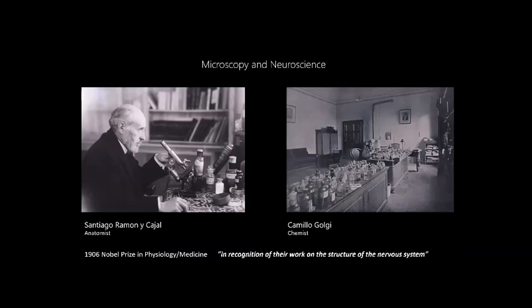Okay, so much like many of you, my lab develops tools for neuroscience, and specifically, we work on developing both microscopes and fluorescent indicators so that we can do new experiments in neuroscience. And by way of introduction, this fits into a very long tradition that might have started with the work of Santiago Ramon y Cajal, who used Ernst Abbe's first corrected microscopes in combination with Golgi silver stains to do a lot of really cool work on the anatomy of the nervous system. In our case, my lab is working on both microscopes and dyes, indicators, to do new types of functional imaging.